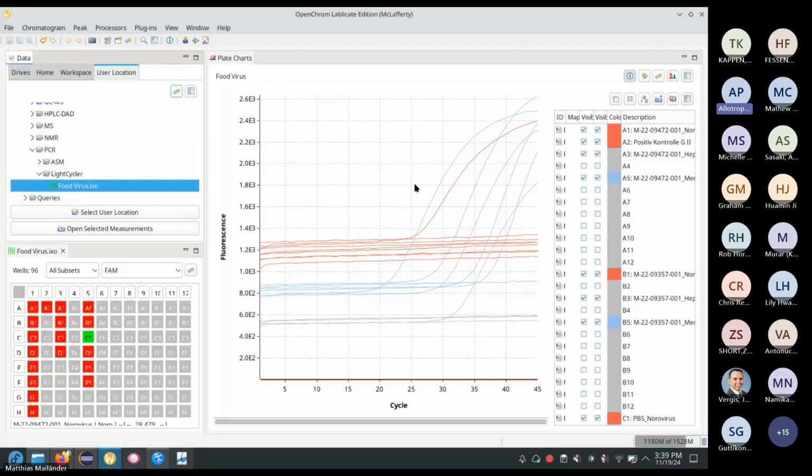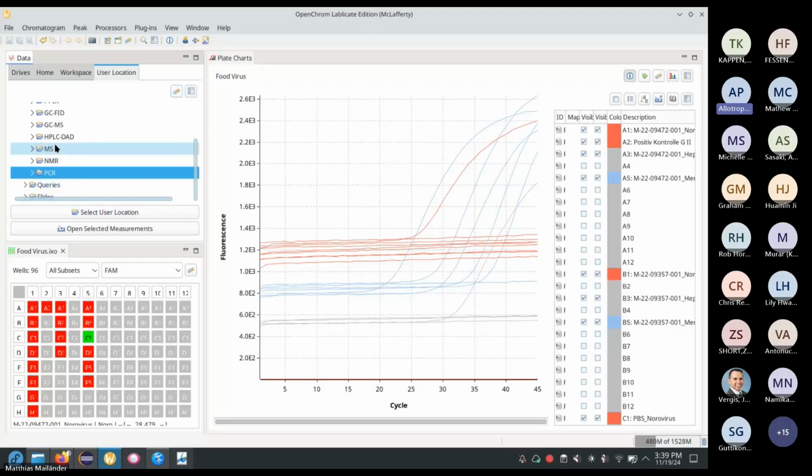And then we say, oh, wait a moment. Why is that? This looks like an amplification, positive sample. What's that? Okay, it's the positive control. It's the German thing for positive control. I'm super glad. I thought we had norovirus in here, but I guess the seafood and the berries are all safe. So it's just this run is validated properly. The controls are set. So have fun at the reception dinner. That's my takeaway there.